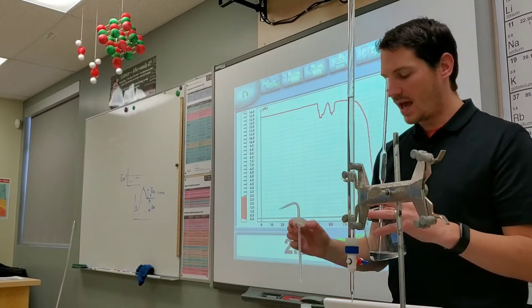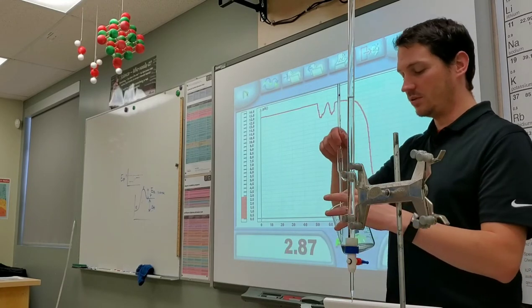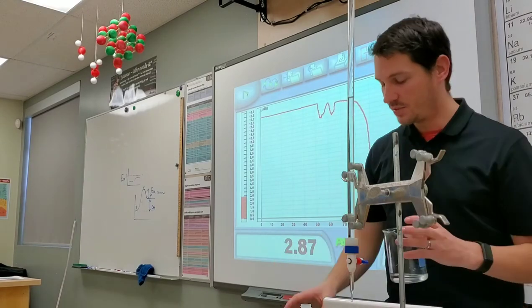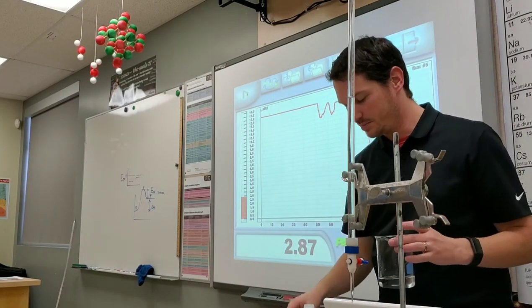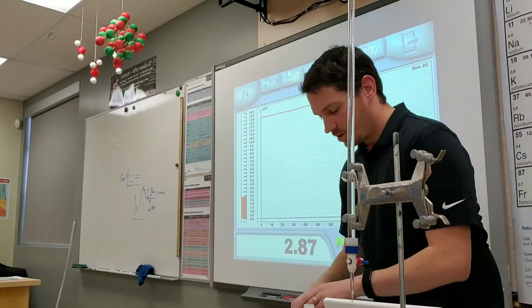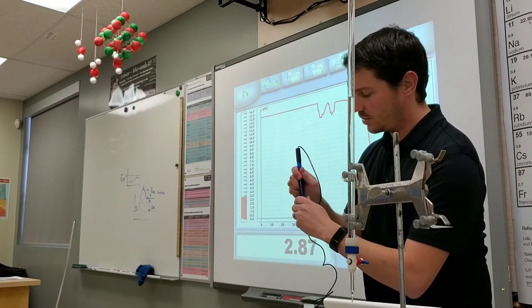Remember, is it okay to add water? Yes. Am I changing the number of molecules? No, I'm not, right? I'm diluting them, yes, but I'm not changing the number of molecules. Let's make sure that we do not run into that problem. Okay, so I'm going to put this on there, and I'm going to put my pH probe in here, and we're going to measure.